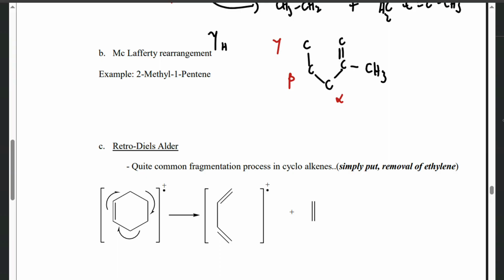So looking at this, this one is like 1, 2, there's CH2 here, right? So this one is 1, 2, 3, 4. So this one is a CH2, this one is CH2, and this one is CH3, which you can also write, when you are dealing with McLafferty, just write it as CH2 and extend the final hydrogen out, the CH3 basically.